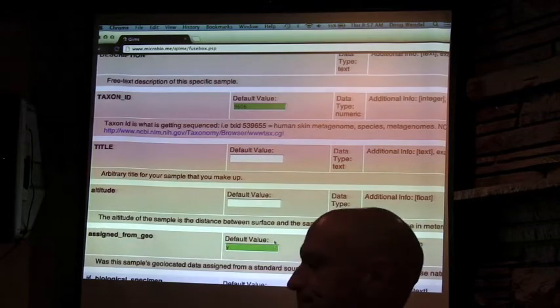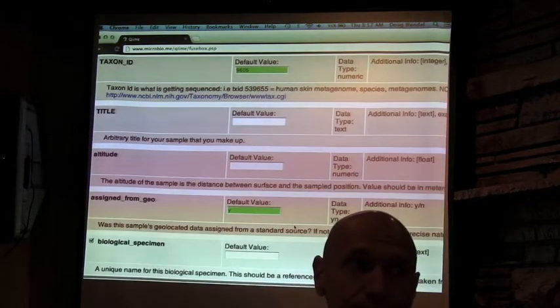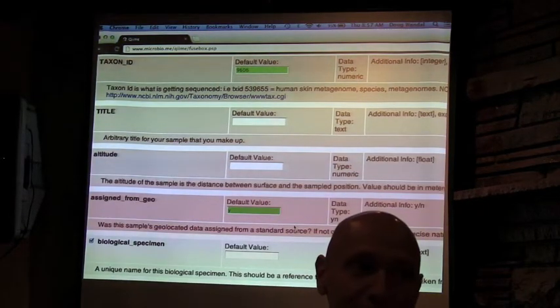How about if you want to create a field that is not there? I'll do that for you. I'll show you what happens.